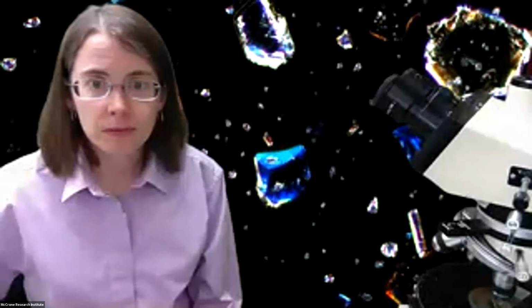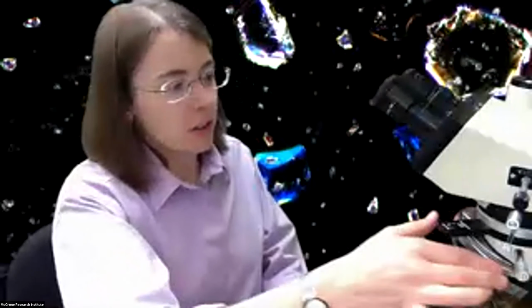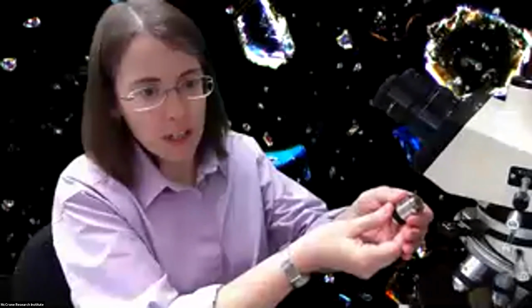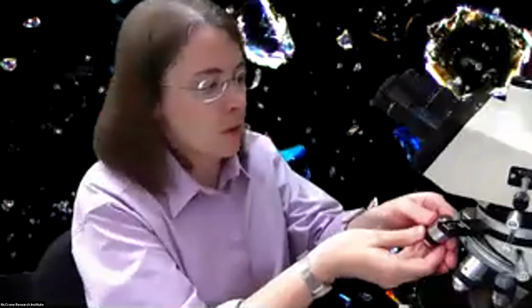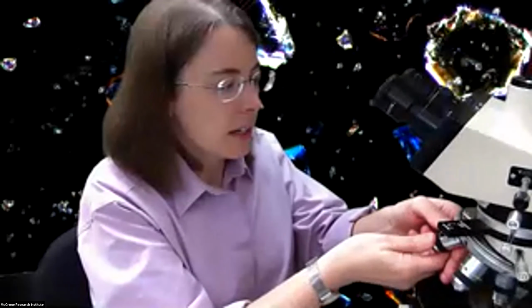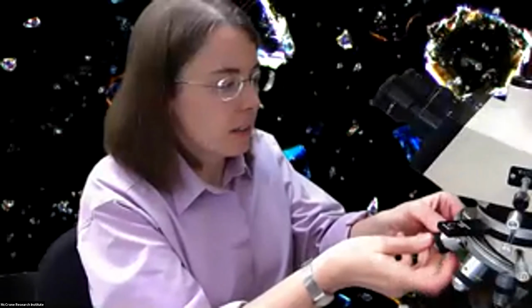Okay, so let's head over here. Whenever you're going to install an objective onto a microscope, hopefully it goes without saying, but you definitely always want to make sure that you're holding these with two hands, just in case it slips out of position. You certainly wouldn't want to drop it. So we'll put this in position. And then again, very carefully screw that in.